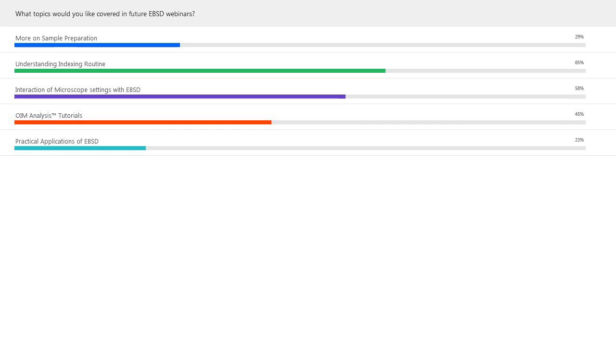So while I wait for the questions to come in, which actually are relatively small right now, you guys are looking at, okay, well, people want to understand our indexing routine. Okay, it's good to know. And also interactions with the microscope settings and the OIM tutorials. It's good to know. More on sample prep. Again, we just did a relatively good one on sample prep, so maybe a lot of you guys just saw that, but we can do other things about it.